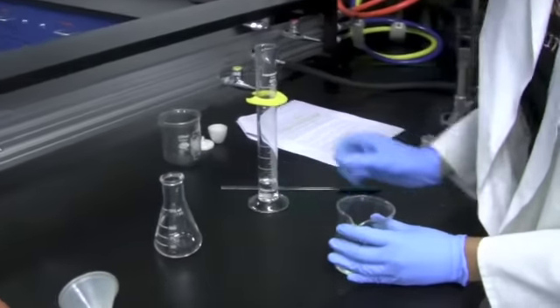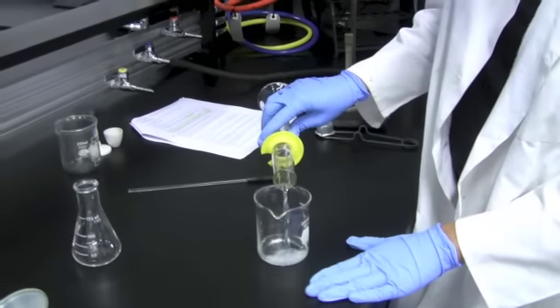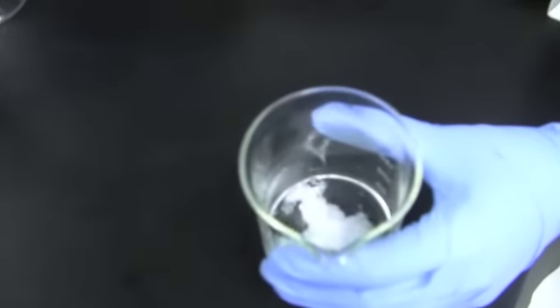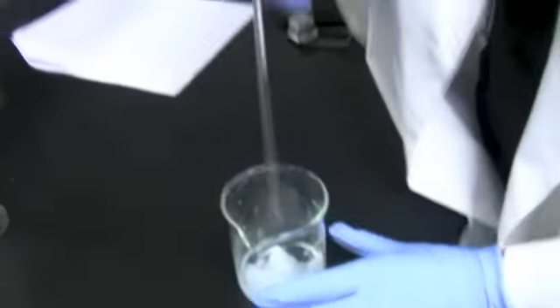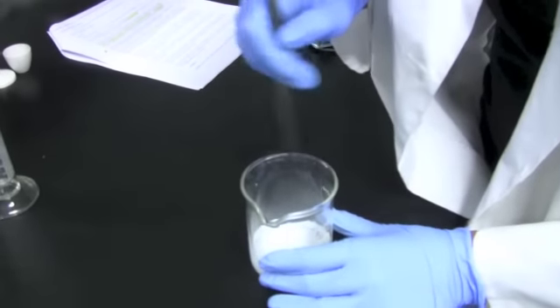Once you do that, you're going to add the 15 milliliters of the sulfuric acid slowly to the beaker and the solution, and you're going to see white precipitate forming like this. However, if you stir, it's going to become even thicker, and eventually it's going to dissolve.